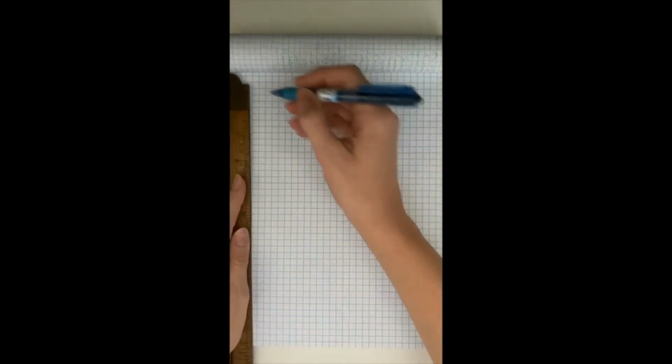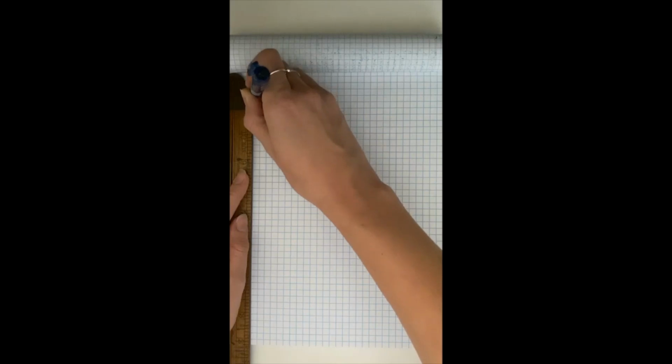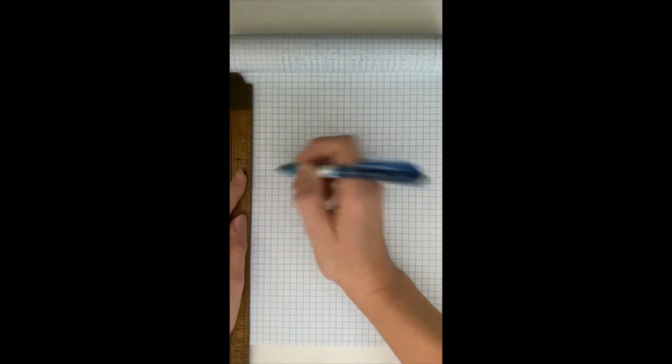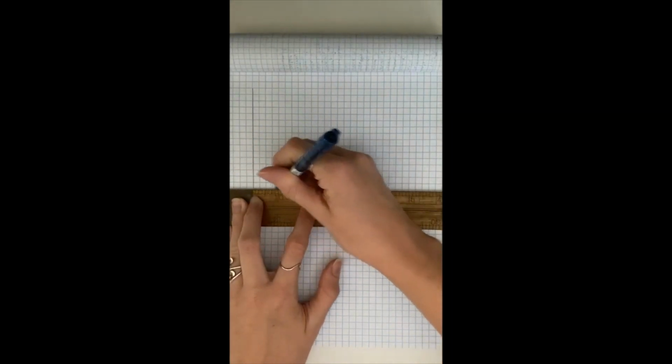So I'm going to be doing a very general overview here, but this is just kind of the basics for graphing, and you're going to have to graph in future labs, so this will help you too. We're going to start just with the general axes of our lab. We've all graphed before, so I'm just going to go ahead and start. It doesn't have to be too big because there's not too much range. So we've got our y-axis and our x.